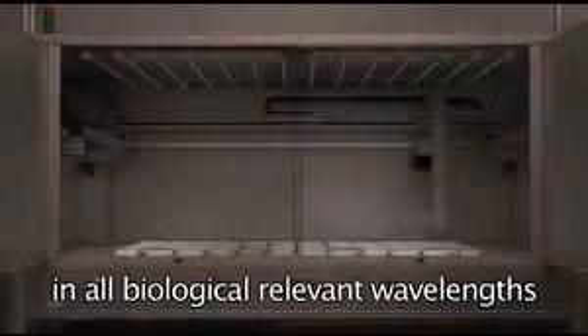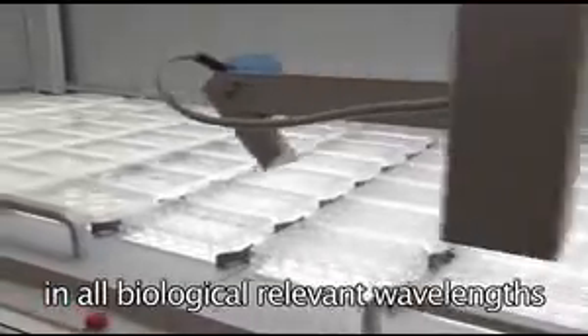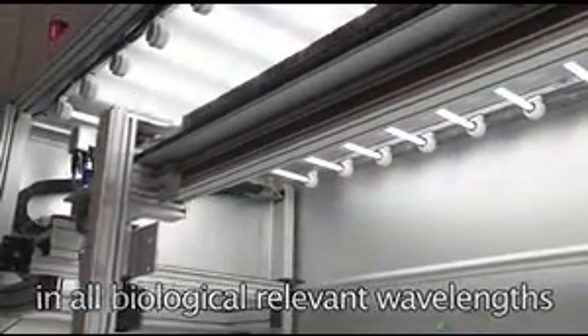The illumination system of the Lemnatec Scanalyzer HTS is fully controlled by the Lemnatec software and can be automatically adapted to different applications and objects. The user may choose between backlight, direct or diffuse top light, near-infrared light, or blue light for fluorescent imaging.